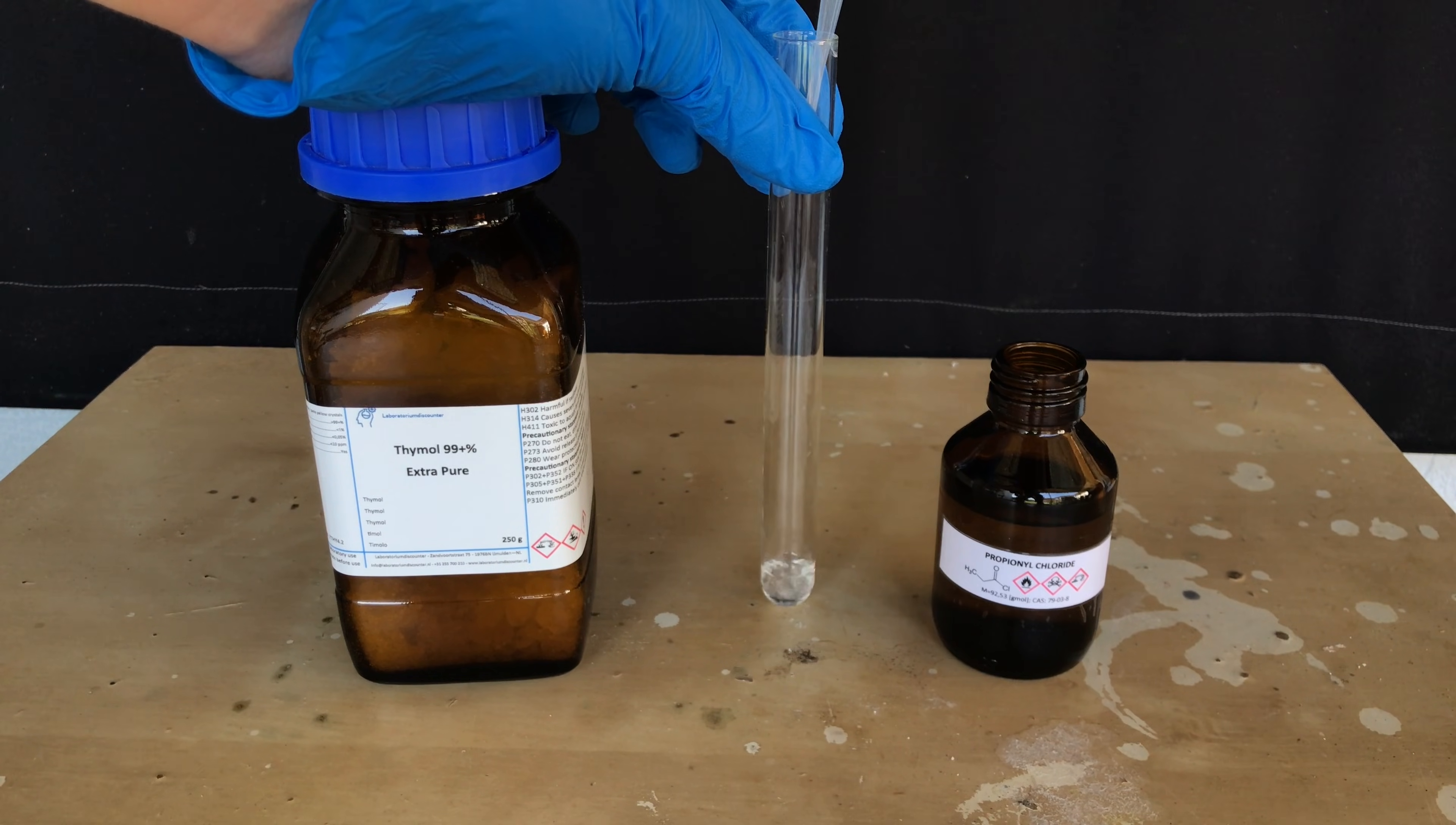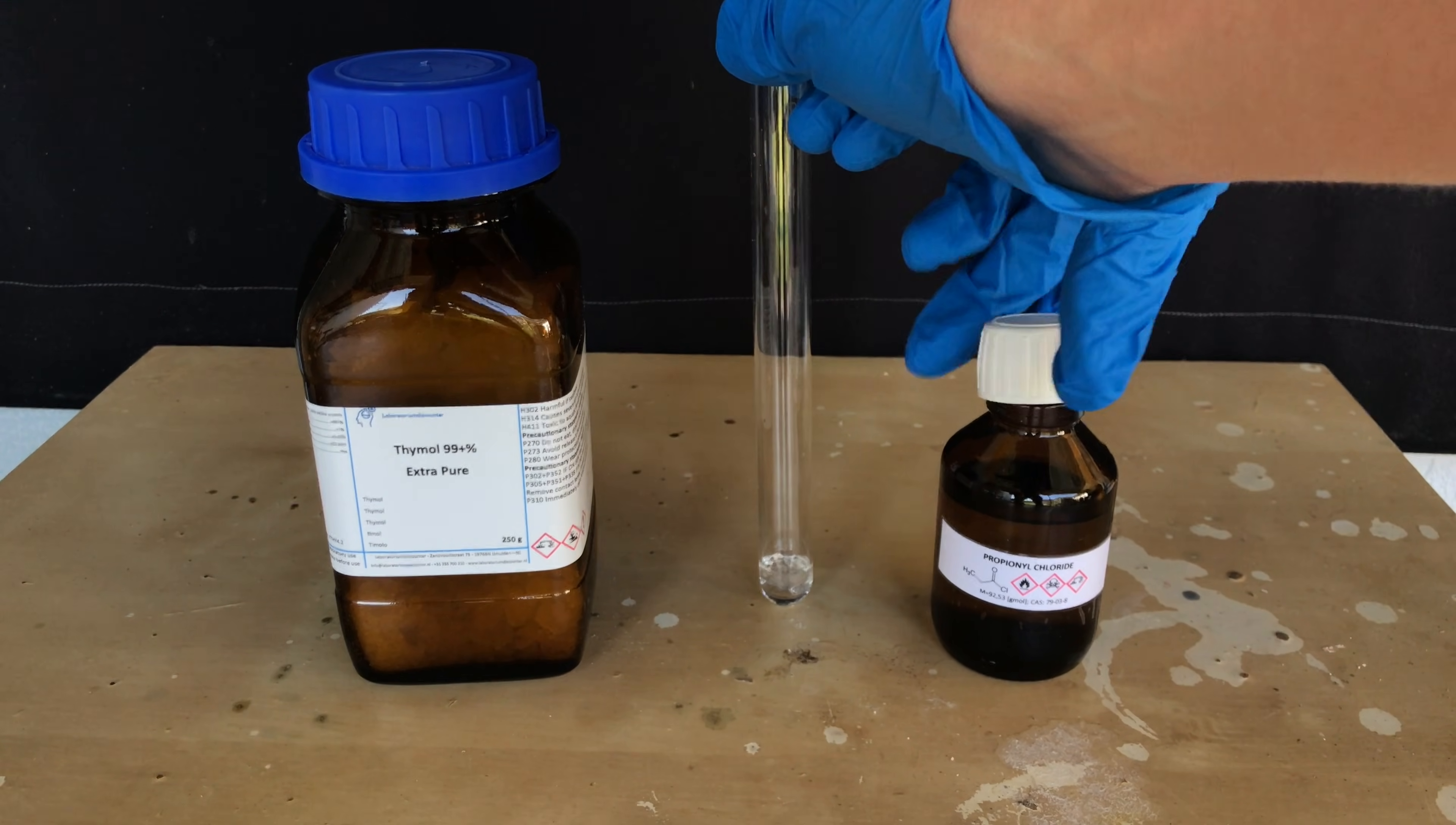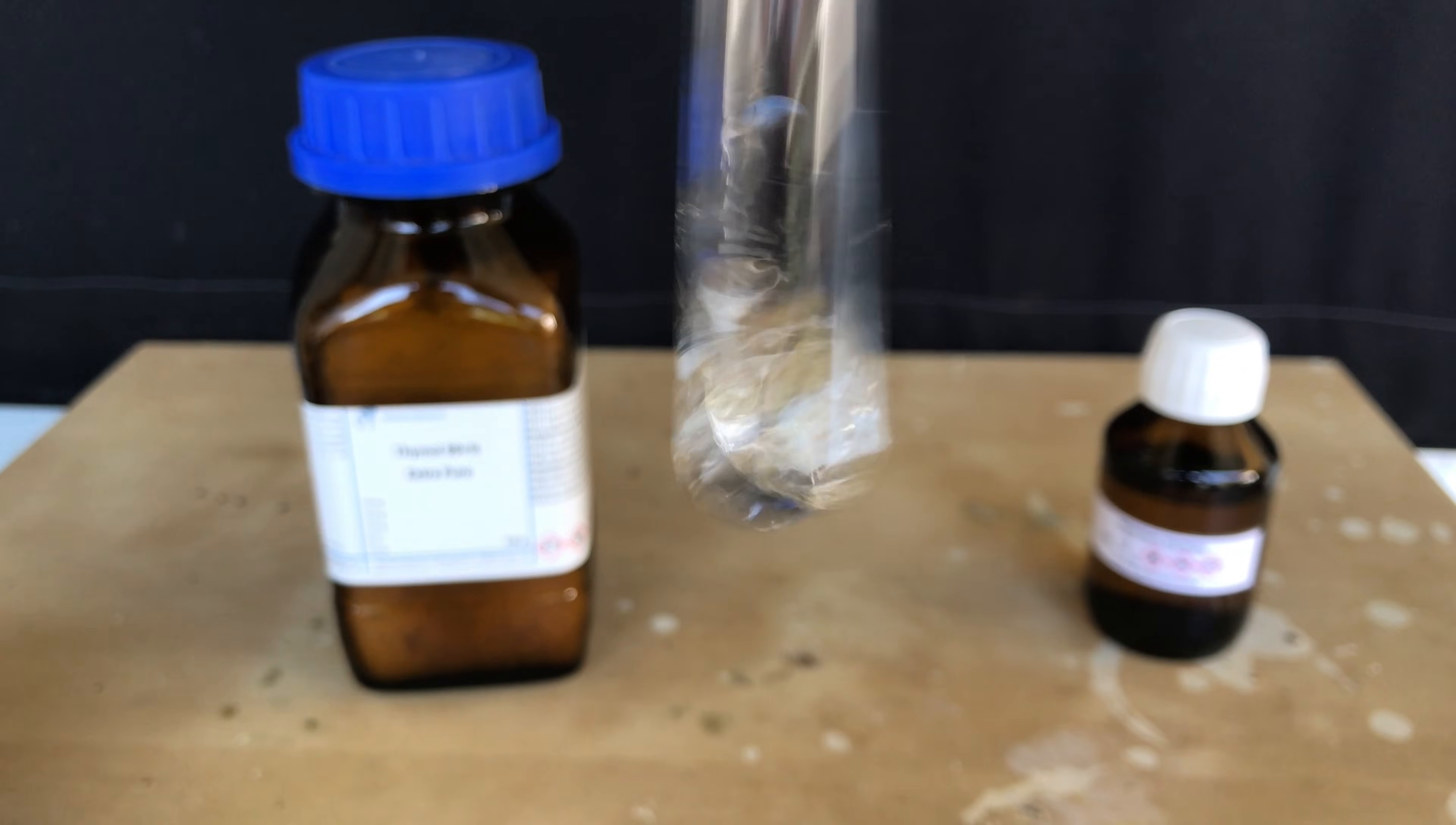Let's talk about reasons why you even want to make propionyl chloride. Occasionally I like to make esters, and you are going to get another video on that soon. If you want to make esters, you can simply mix an acid chloride with your alcohol and you get the ester and hydrogen chloride.